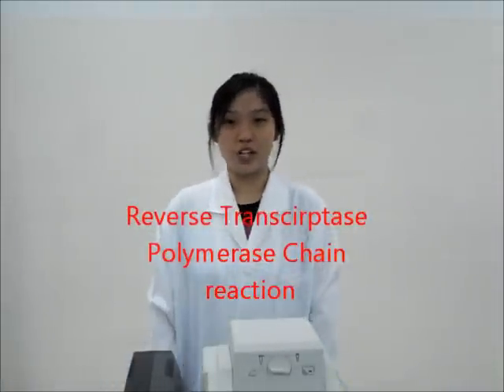Hi, I'm Brandon, and today we're doing RT-PCR — Reverse Transcriptase Polymerase Chain Reaction.